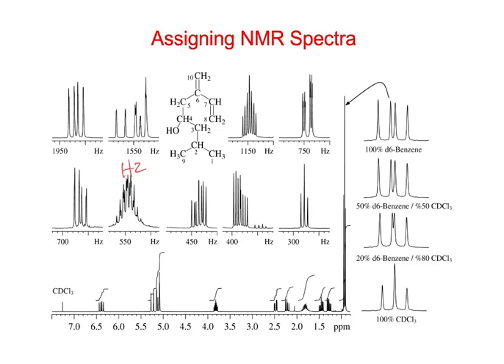H10 would be a singlet, right? H10, well, there's 2 protons up there. So it could be a singlet, but because there's not really a plane of symmetry down through the middle here, right? We have this double bond over here, and we have different stuff over here. And so, if I was just looking at the molecule, I'd probably expect the 2 H10 protons to be different. Okay.